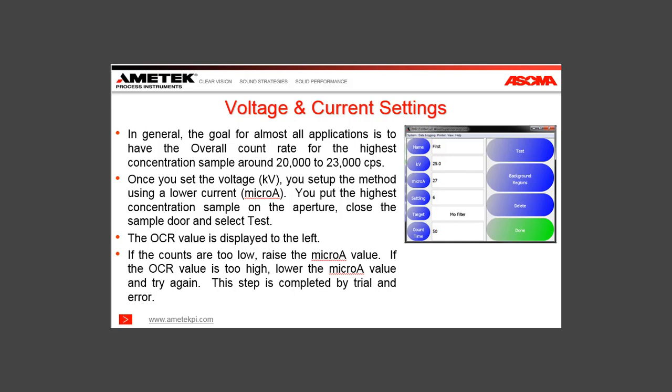Once you set the voltage, you set up the method using a lower current microamp setting. You put the highest concentration sample on the aperture, close the sample door, and select Test. The OCR value is displayed to the left. If the counts are too low, raise the microamp value and try again. If the OCR value is too high, lower the microamp value and try it again. This step is completed by trial and error.